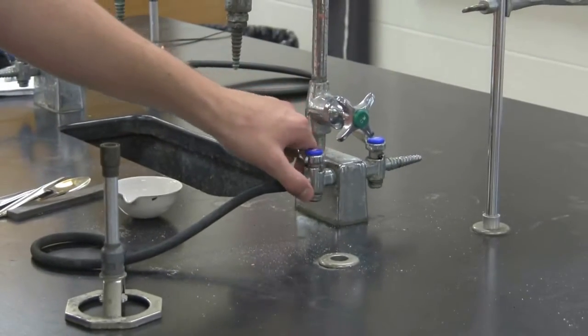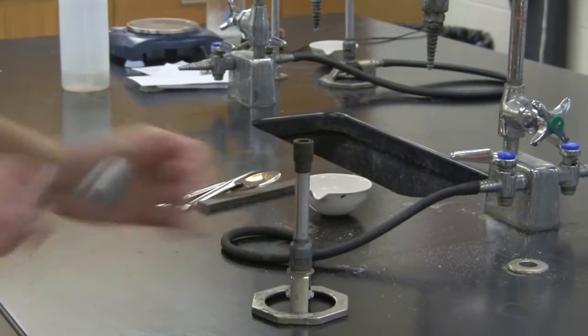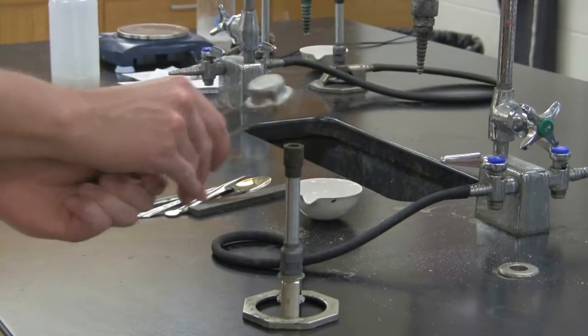Turn the gas on by making the handle parallel to the cord. Make sure the Bunsen burner's cables and top are open for fires.